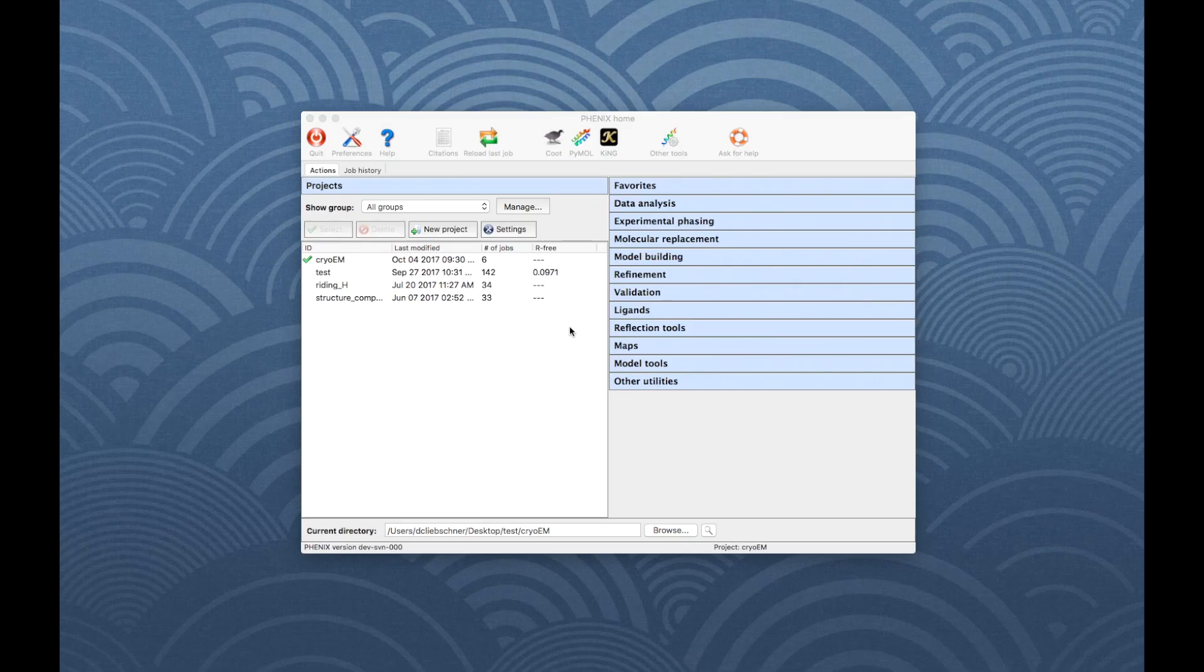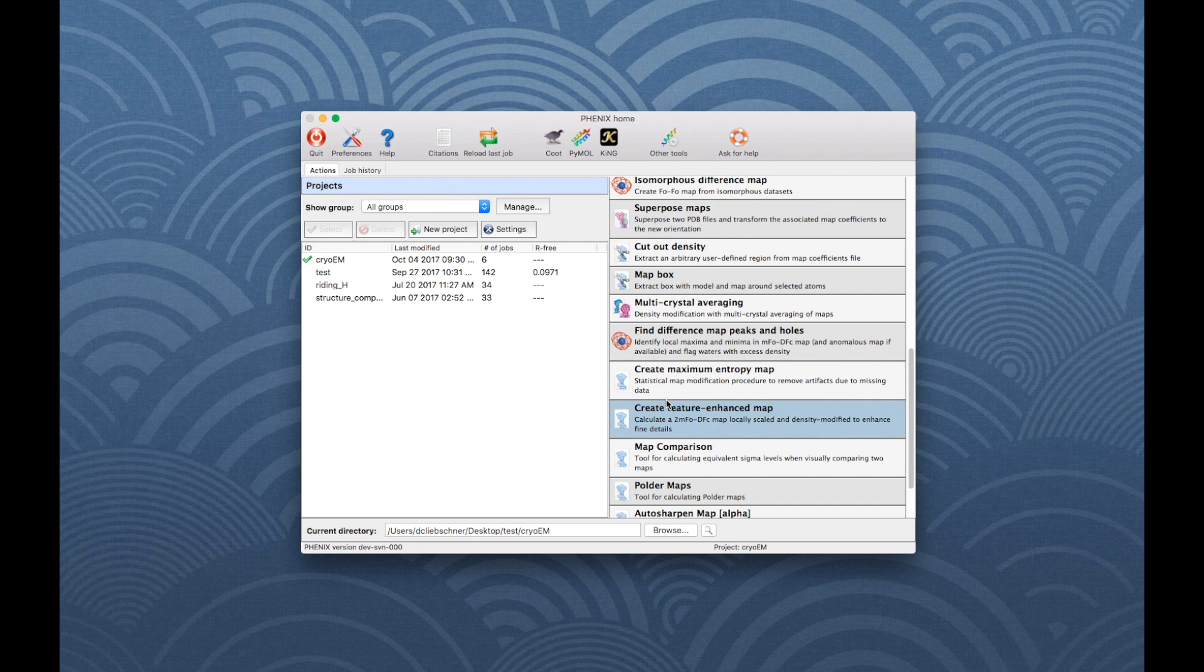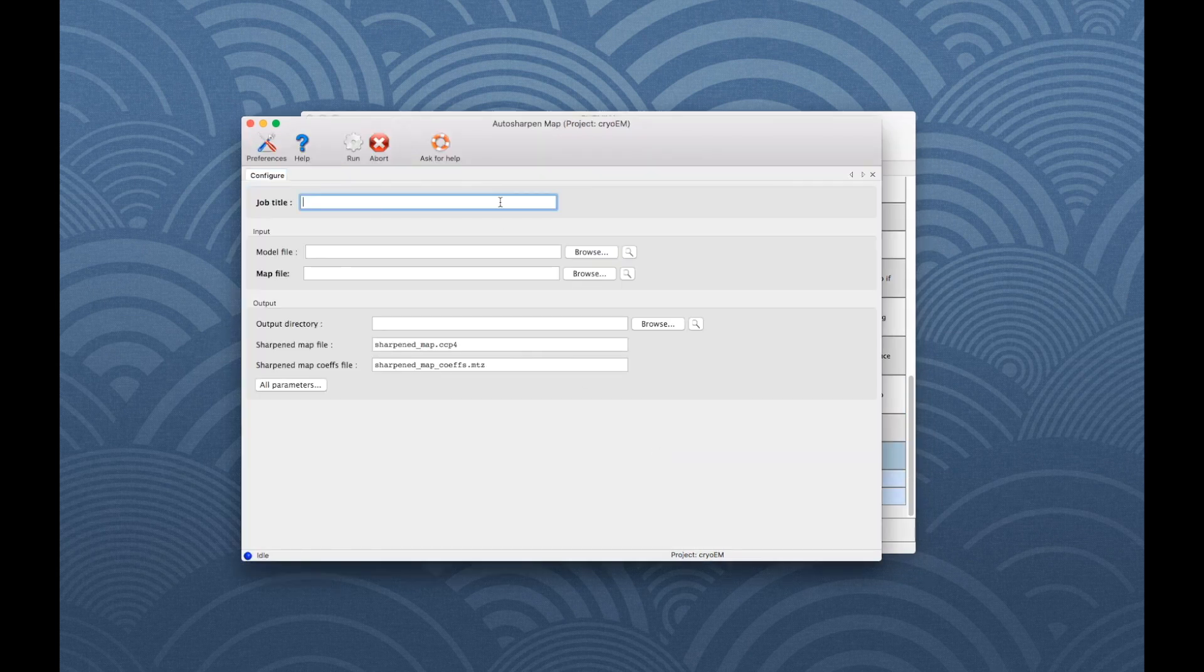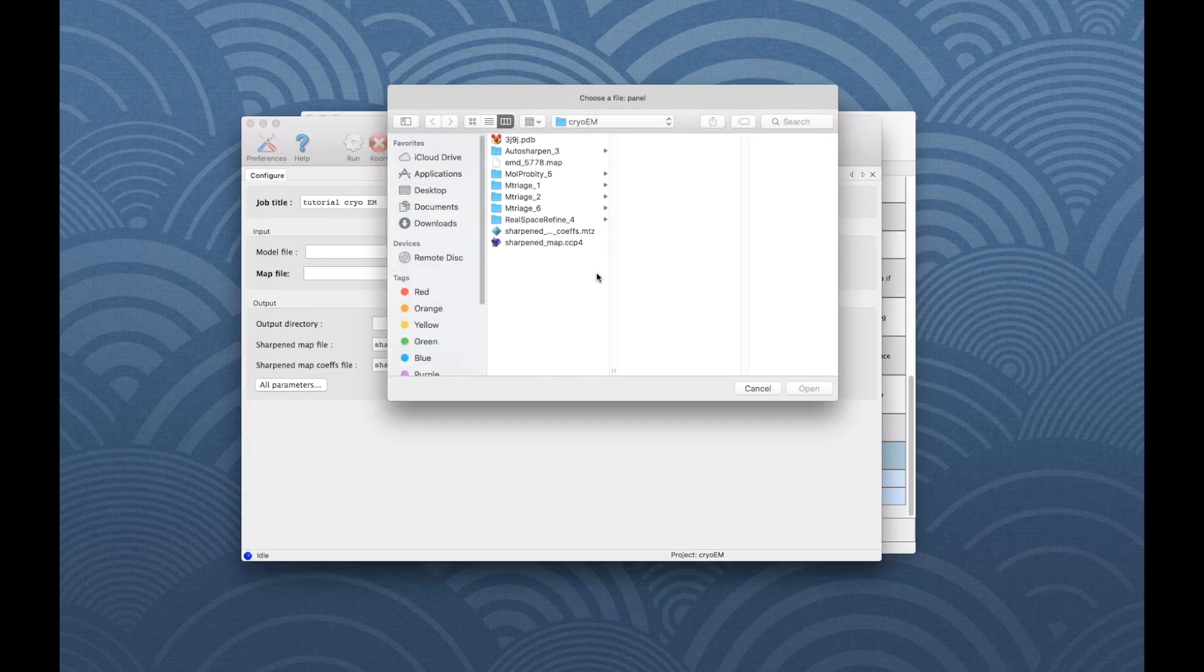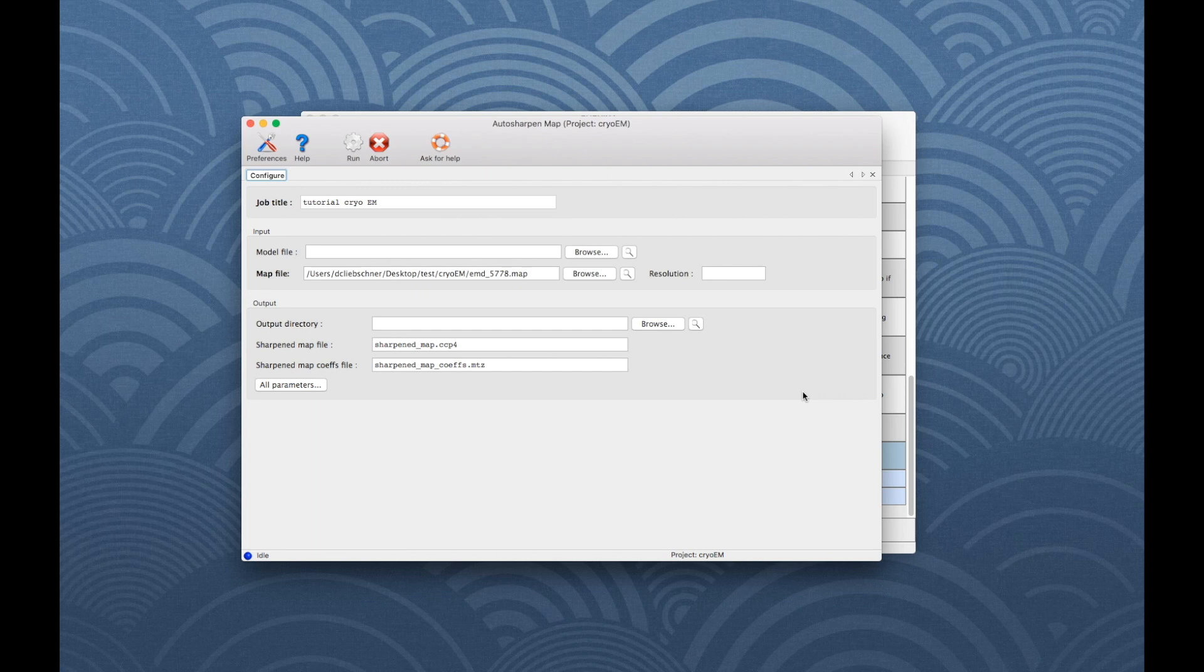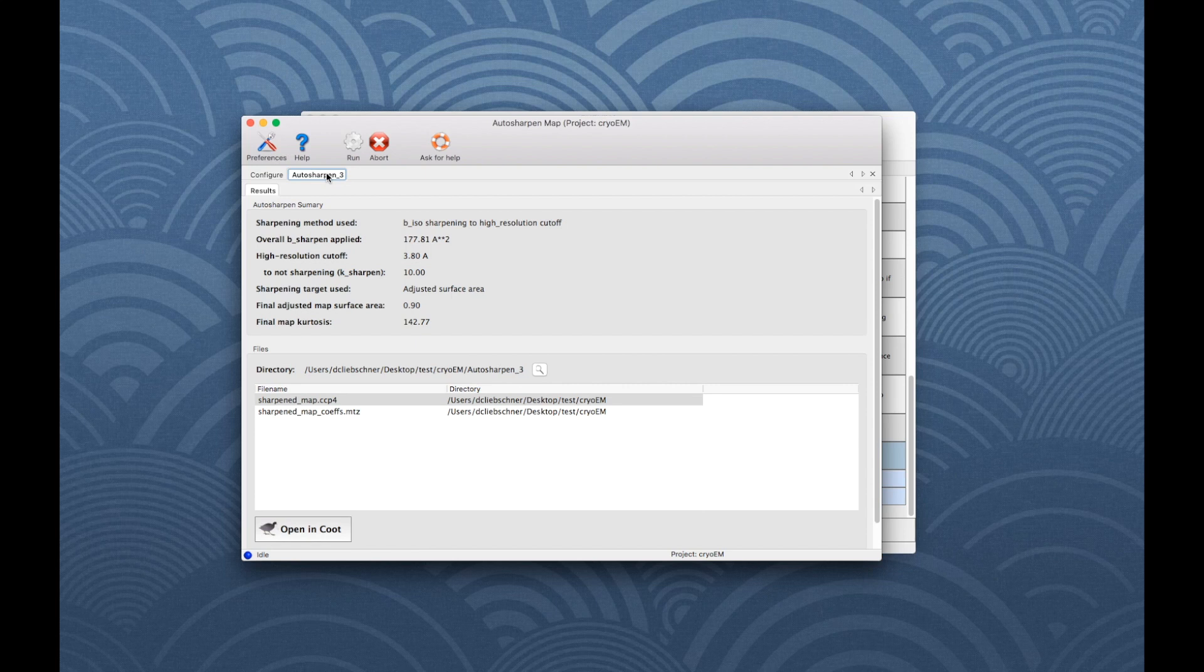The next step is to run Auto-Sharpen. Go to Maps and scroll all the way down to find the Program button. Minimal input is a map file. In addition, a model file can be used. The Results tab shows a summary of the sharpening results. The program outputs the sharpened map in CCP4 format and a MTZ file with map coefficients.